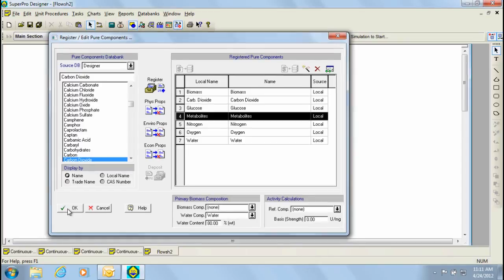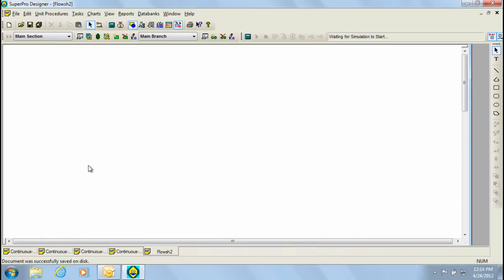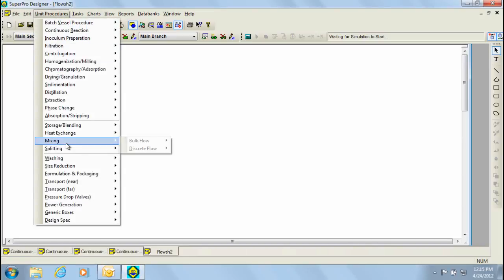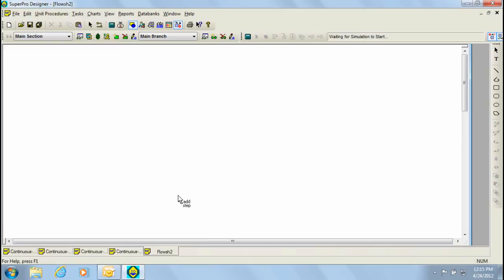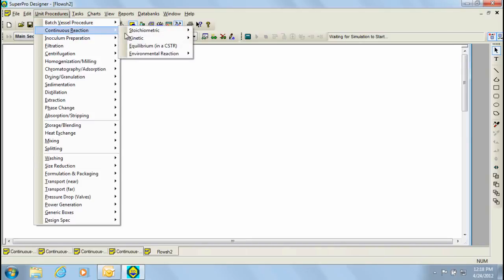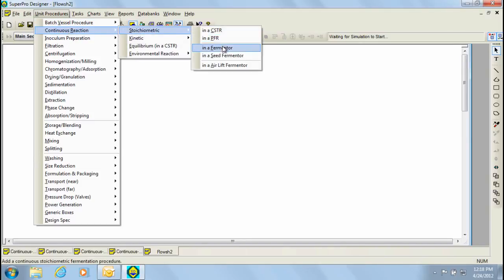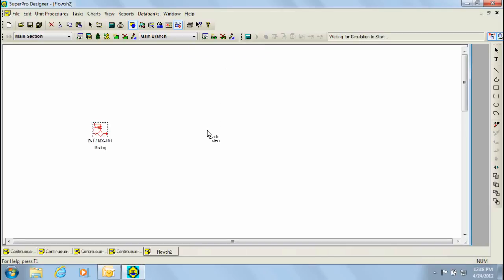Let's now click ok to return to the flow sheet. The next step in building this model would be to add the unit procedures we're going to use. The first of these units is going to be a custom mixer, which I can select by choosing unit procedures, procedures, mixing, bulk flow and then the custom mixing option. The next unit we'll need to add is the fermenter. For vessel procedures, it's important to select the continuous form from the vessel options as both a continuous and batch option exists. To choose the continuous form, click on unit procedures and then select continuous reaction, stoichiometric, and finally choose the fermenter as the vessel procedure.